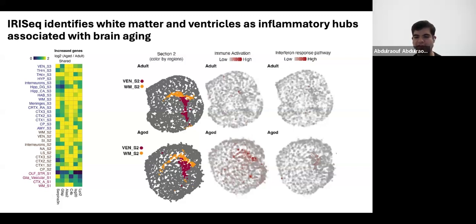However, you have a cleaner signal with the higher resolution, where you're able to infer the cell localization as well. Now the question might be about the computational side. You might have an error from the reconstruction when getting the cell-cell interaction. That's definitely a cause for concern. But it could be validated by, for example, using the 50 micron beads as well, using two different chemistries or bead sizes to validate the cell-cell interaction.